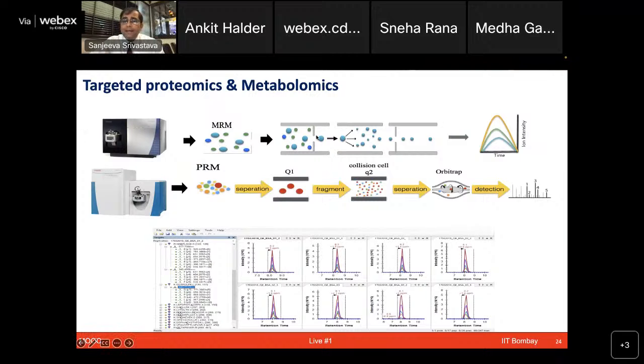Now for those peptides, you use some software, especially software known as Skyline, when you define these peptide sequences and generate the specific transition list. And now you're only going to monitor those transitions of these peptides which are of your interest. You are going to remove thousands to millions of peptides which are still part of the sample, but you are not interested in every single thing. You are especially looking at the peptides of your interest which have shown good differences between your control and treatment conditions, which have passed a lot of statistics and showed good fold changes. Only those you are taking forward.